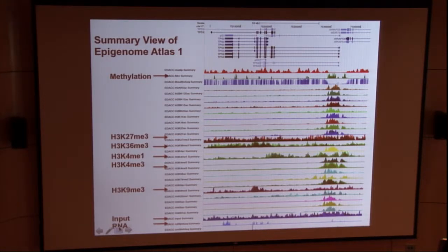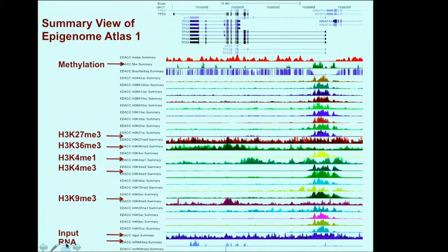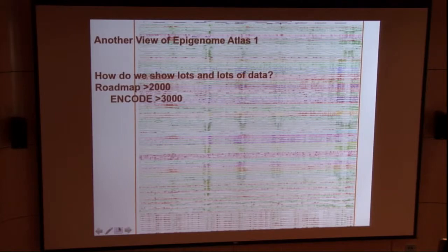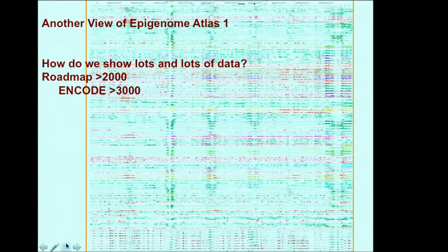And then this is actually using some of the more advanced visual technology by overlapping multiple tracks in the same track space so that we can compress the data. So basically, if you look at H3K4 monomethylation, this enhancer track, we can actually put multiple data in one space. So this is this rainbow display. So it's already getting pretty complicated, and this is another way of looking at the data on the UCSC genome browser.